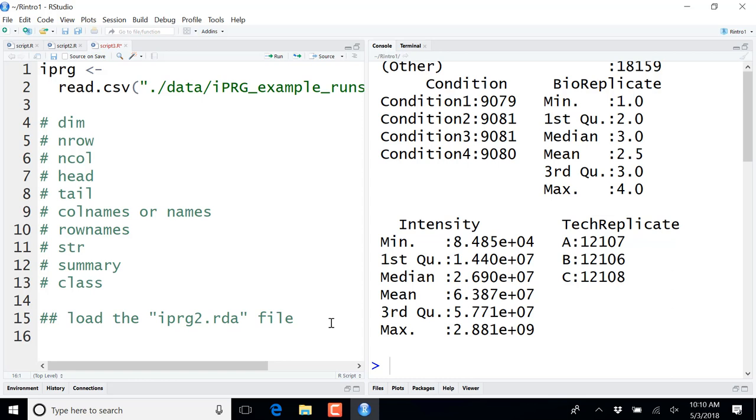This depends. It's something your collaborators use, and it's actually useful to collaborate on projects. Maybe they're doing some analysis and want to share some of the results. Then it's also very useful to store results in an RDA file, if you have RDA files.